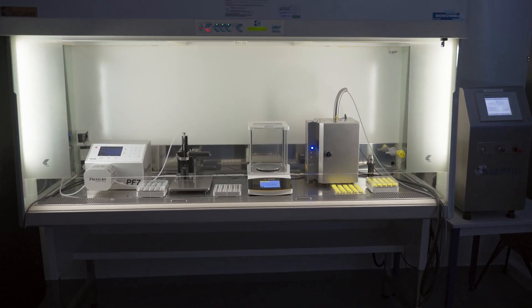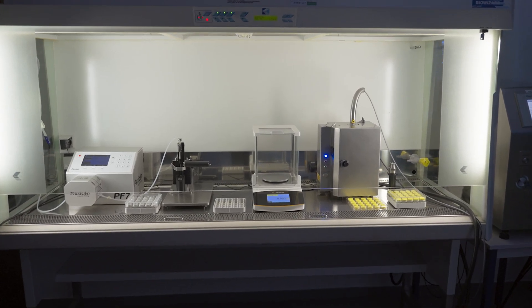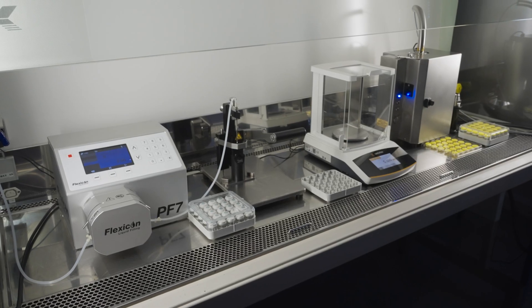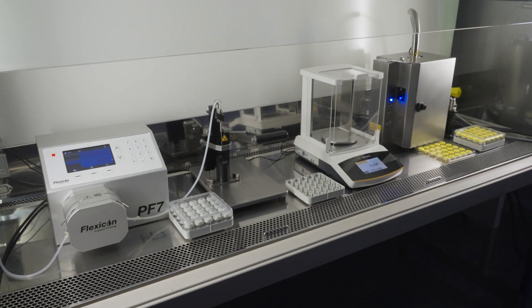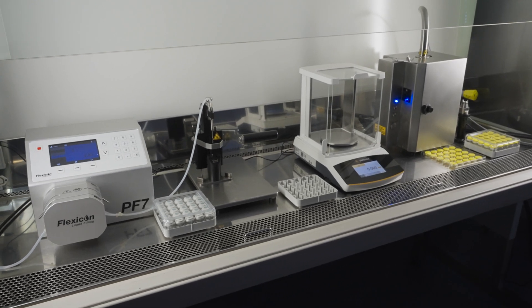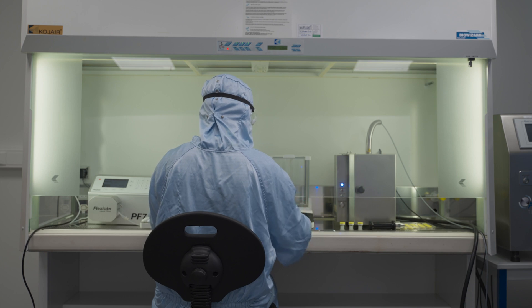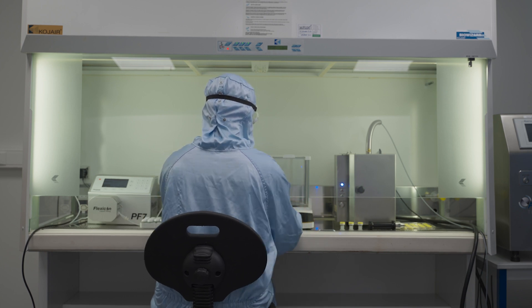The Crystal M1 fill-in station is used for aseptic fill-in finish of small batches. It is a multi-format benchtop system and it is a good fit for process development and GMP manufacturing for batches ranging from just a couple of vials to several hundreds.